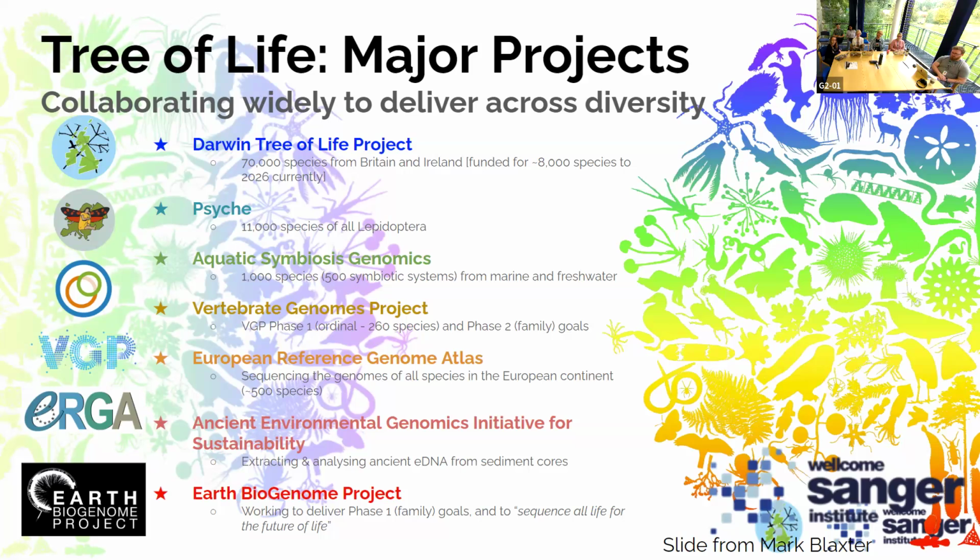So we will have somebody working on Psyche samples next door to a person who's working on an ASG sample, in the same lab as Ben is working on some of his plant samples. We also have another team within the Sanger Institute that handles some of the more routine work. As we develop routine systems, we're able to transfer those processes over. But essentially, the Tree of Life Core Lab is the melting pot that all of these different projects come through and then are treated with whichever protocol is required so that we can aim to get those reference level genomes.